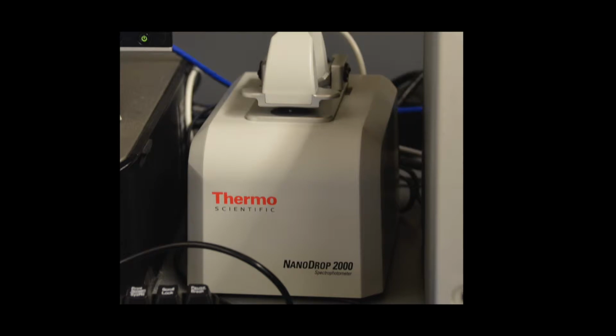The nanodrop uses small quantities of sample to measure the concentration and purity of nucleic acids. It is recommended that you nanodrop your samples directly after RNA extraction. Using the nanodrop requires approximately 30 minutes, depending on how many samples you measure, so plan accordingly. The nanodrop is located on the fourth floor of Carnegie.